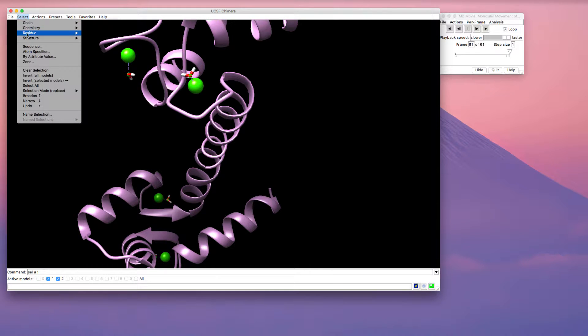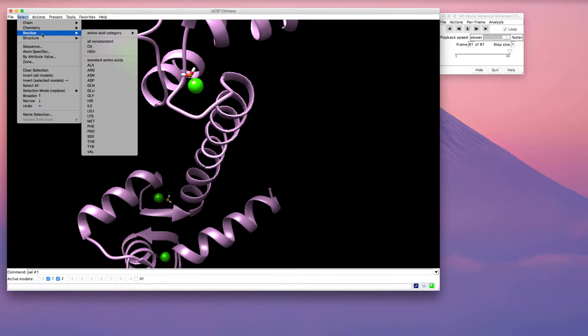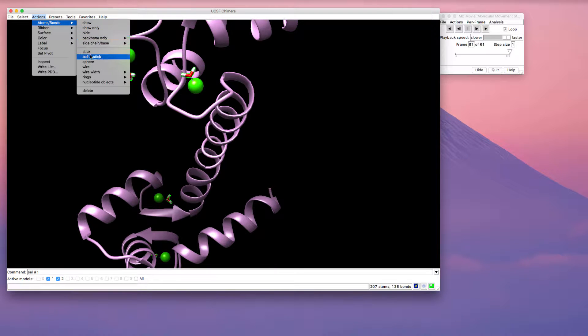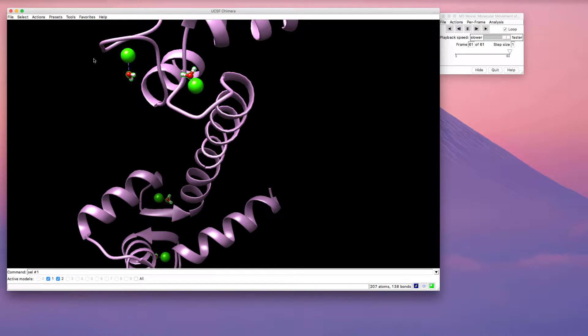I'm going to go ahead and select the entire water molecules again, and I'd like to show those in ball and stick. So now that looks like what we usually see for a model of water. Now I unselect by pressing control and clicking in the background.